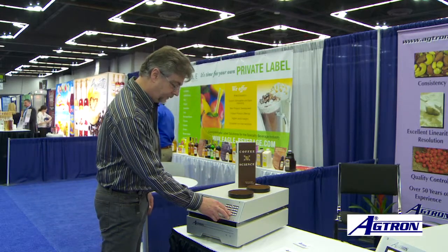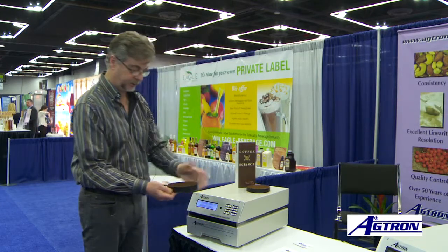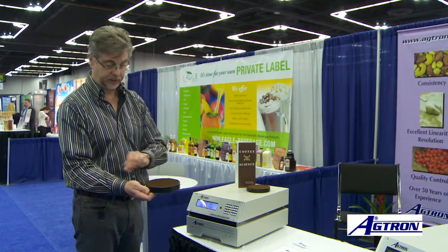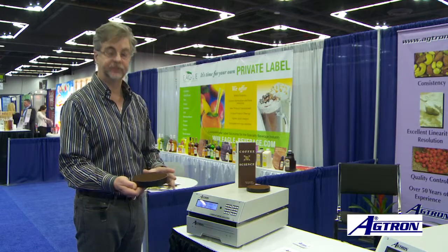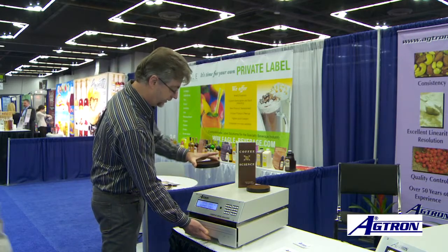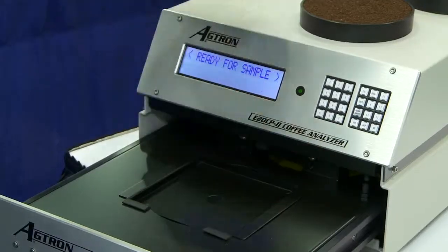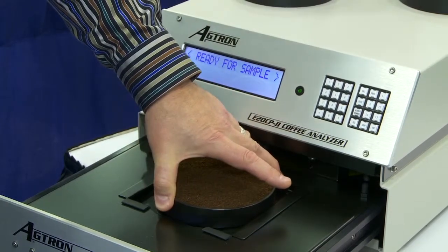Once that's finished, then I can introduce the standards or the samples to be evaluated. These are ground samples, and we use a straight edge to make a flat conformal surface. This is a good representation, an average representation of the chemistry in the coffee. We're looking at a very large area as well. This is really important. Gives us a better idea of what the roast development is.